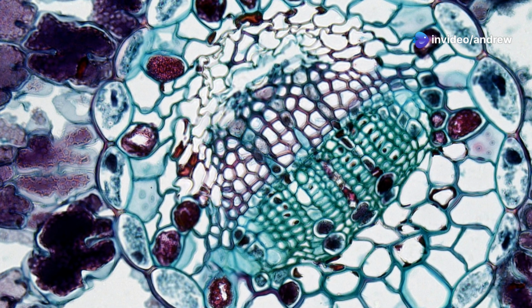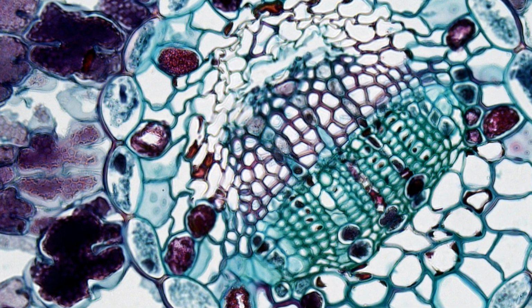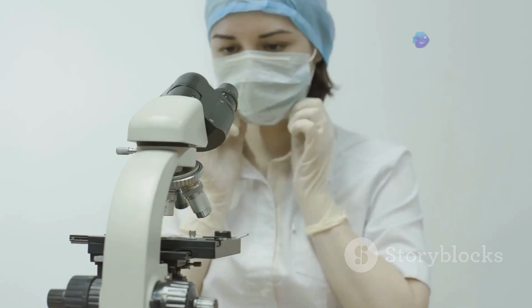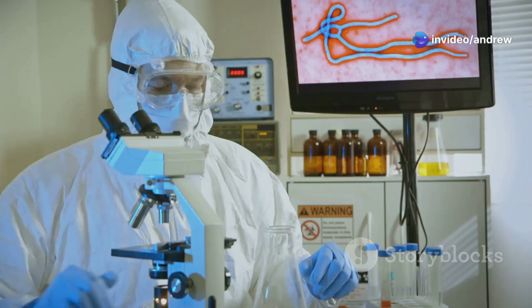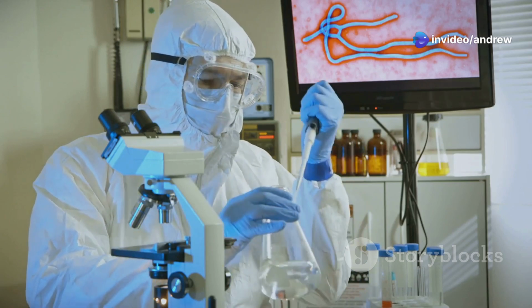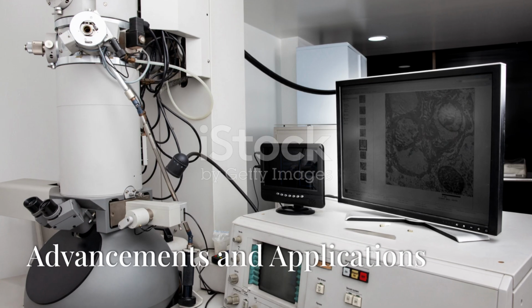In biology, electron microscopes are used to study the structure and function of cells and tissues. This information is used to understand how cells work and to develop new treatments for diseases. In medicine, electron microscopes are used to diagnose diseases, develop new drugs, and study the effects of environmental toxins on human health.